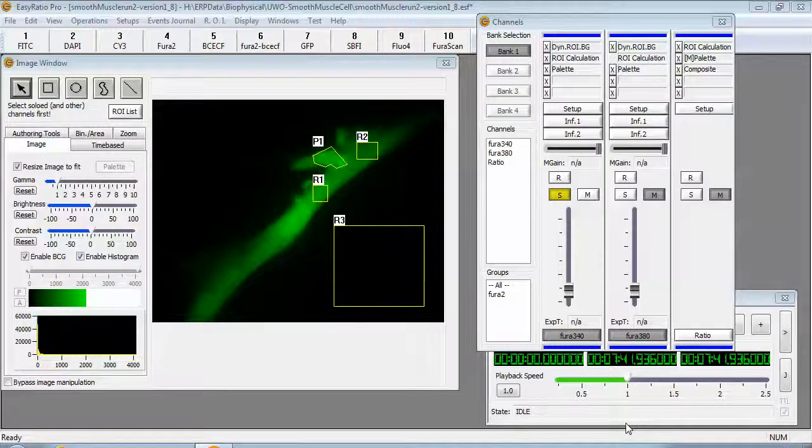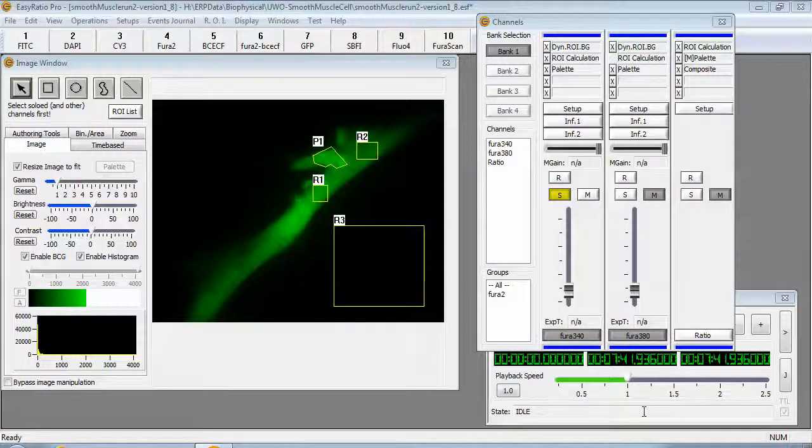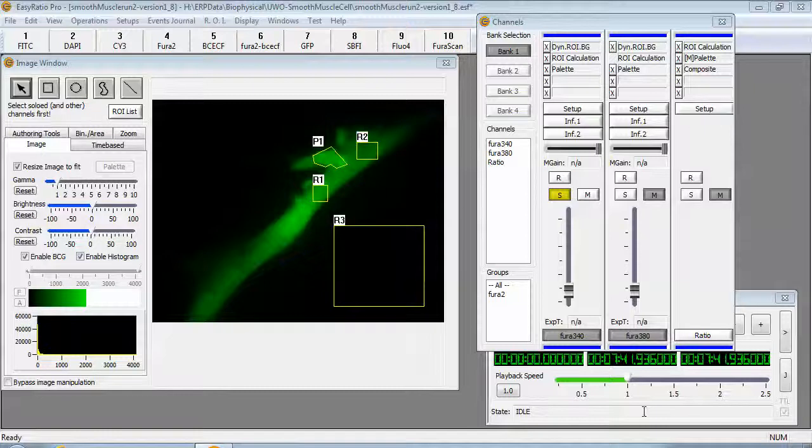Metafloor is a powerful program that can generate FRET analytical data, create Ponychen ratio images, and many other analytical applications.